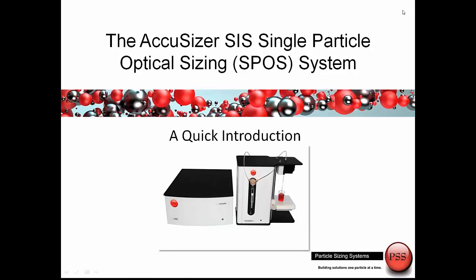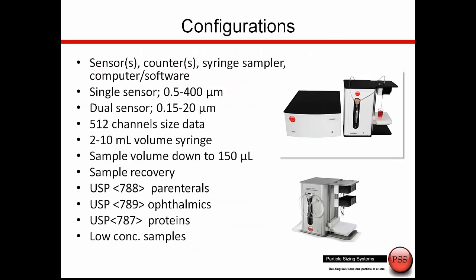Welcome to a short introduction of the AccuSizer SIS single particle optical sizing system. The AccuSizer SIS system can be configured various ways, but they always include a sensor, a counter, a sampler, and the software and computer that operates the system.